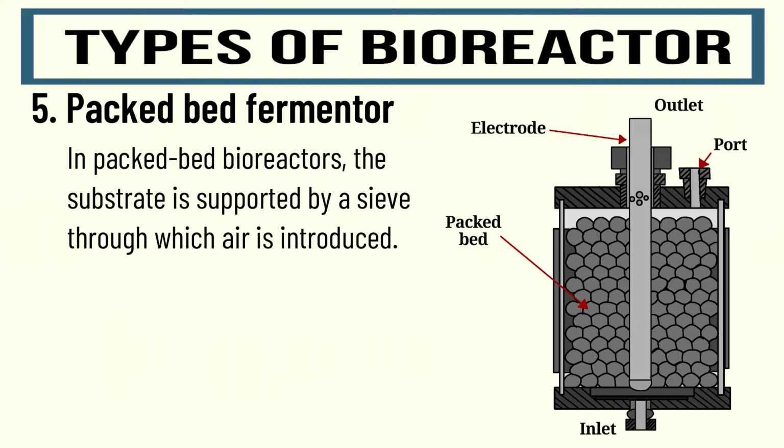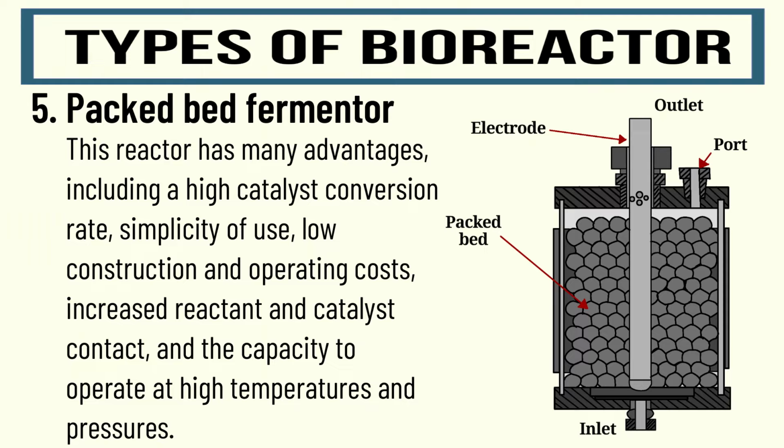In this reactor, the substrate is supported by a sieve through which air is introduced. This reactor has many advantages, including a high catalyst conversion rate, simplicity of use, low construction and operating costs, increased reactant and catalyst contact, and the capacity to operate at higher temperatures and pressures.